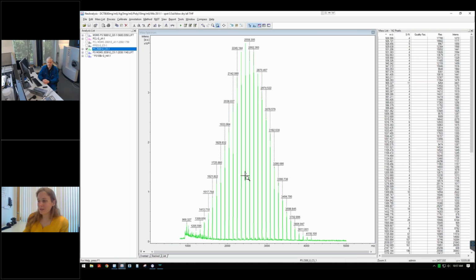Here's another. Will MALDI TOF be able to identify branched polymer? Yes, depending on what you are calling branched, if it's a dendrimer or a star or things like that. But if you're talking extremely high molecular weight with branching as far as a network, that's a little more difficult with some sort of degradation prior to MALDI, because we can't desorb and ionize a complete network of chains.